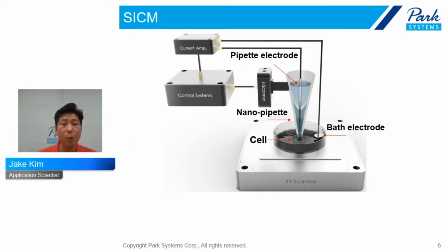To be a practical in-liquid imaging tool for biological samples, the tool should satisfy the following three requirements. At first, it should acquire images in true non-contact. Second, it needs to have stable imaging feedback during imaging. And lastly, the imaging operation must be simple and easy.